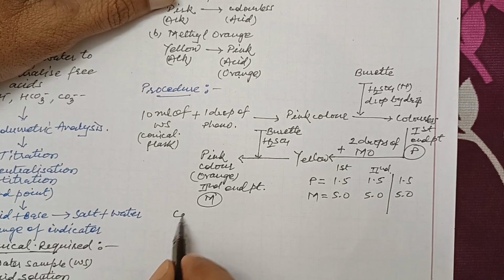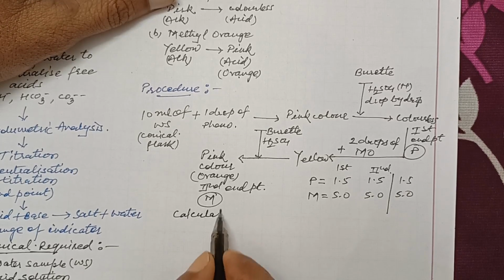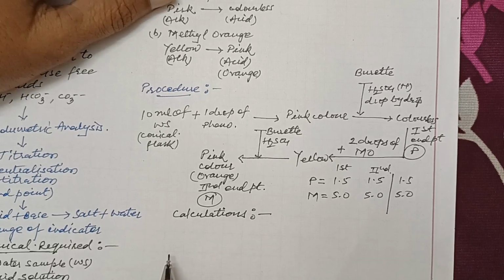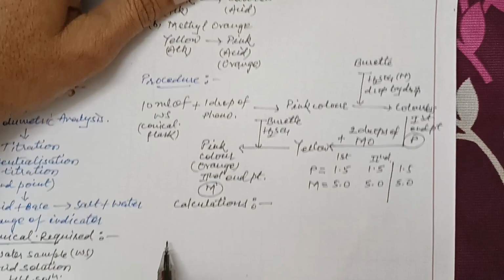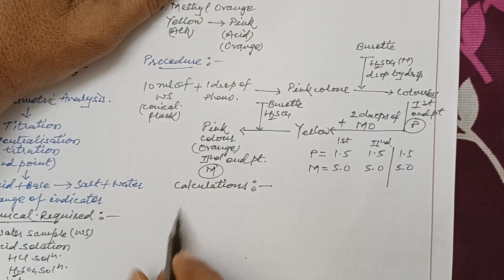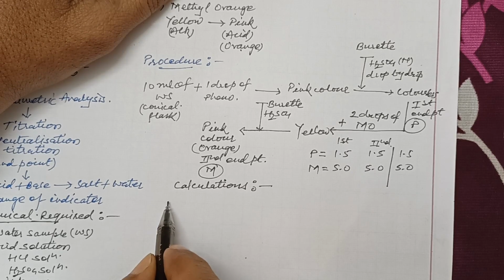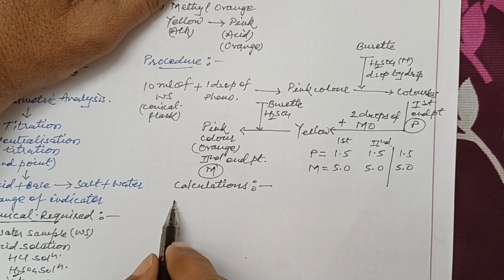Now, calculations. We use a formula for calculating the alkalinity content of the water sample.